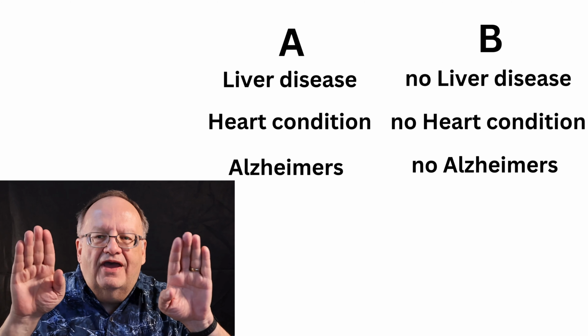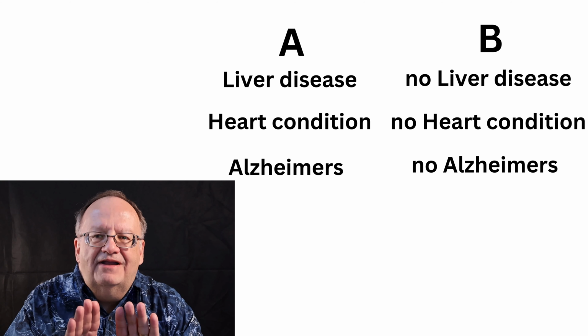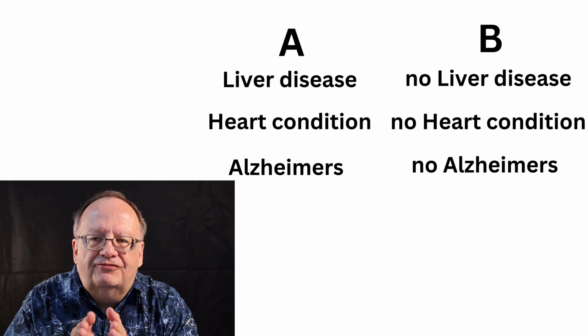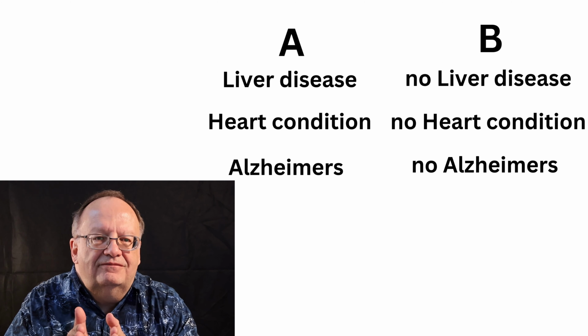Set it up so that you have a contrast. It's basically a controlled experiment. Set it up so you have a contrast between 2 sets, and then we're going to find what's different. Because what's different, those are the molecules we care about. We've identified our biological problem for our software by picking set A and set B. And the differences between these 2 sets relate specifically to our biological problem.